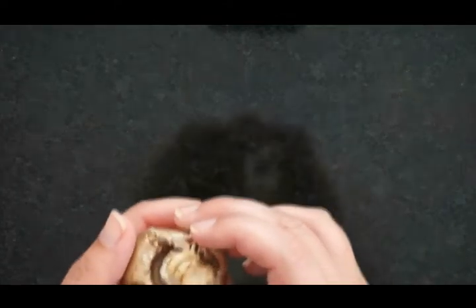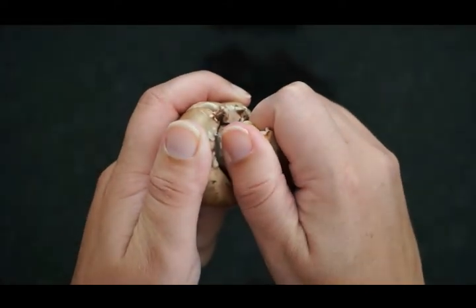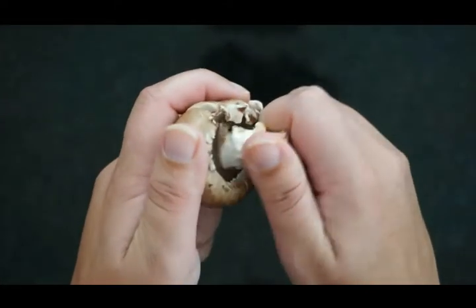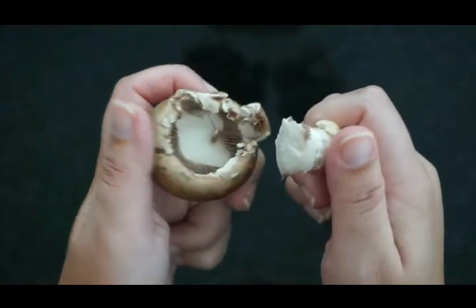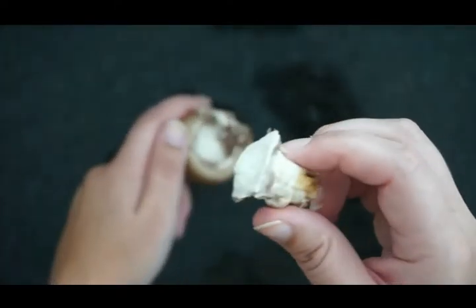In the first part of the lab, you're going to very gently break off the stalk from the mushroom. I got a few gills with mine, but you can see there's still plenty intact in there.